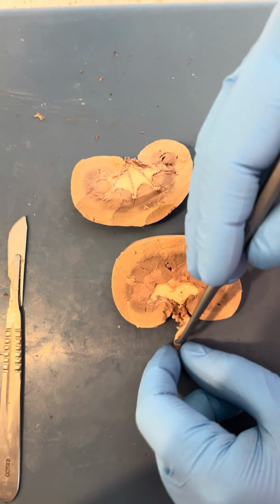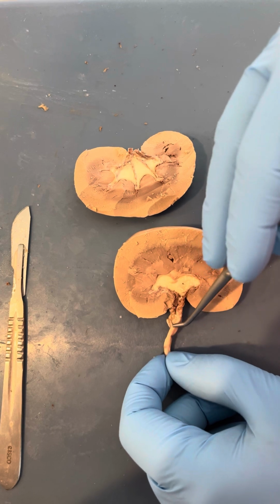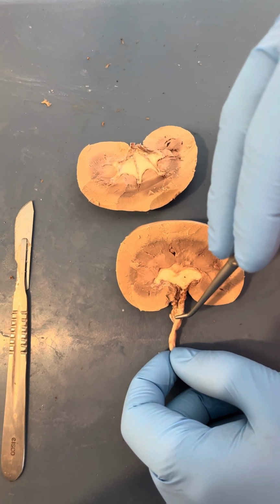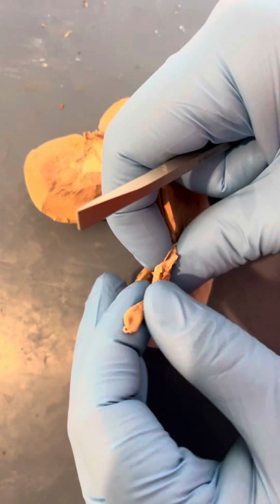As I open up the kidney here, this is the ureter, and it is a tube that connects to the bladder, and it allows for urine to flow and collect in the bladder for later elimination.